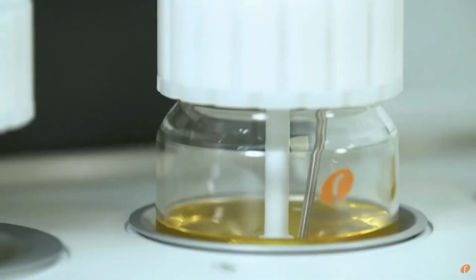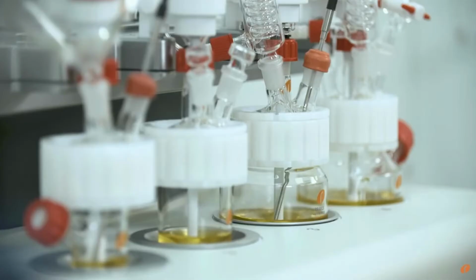A lot of systems can come with just magnetic stirring and you have a little bead in your flask. Now, the issue with that is for our product, that will cause degradation and you destroy the end product. So we needed overhead mixing.